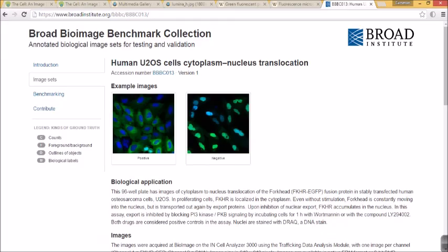Furthermore, we can perform these processes and analyses automatically on a large number of images to provide statistical power. Quantitative analysis and automation are the two great advantages of computational image processing and analysis. Together, they make a lot of information available from biological images.